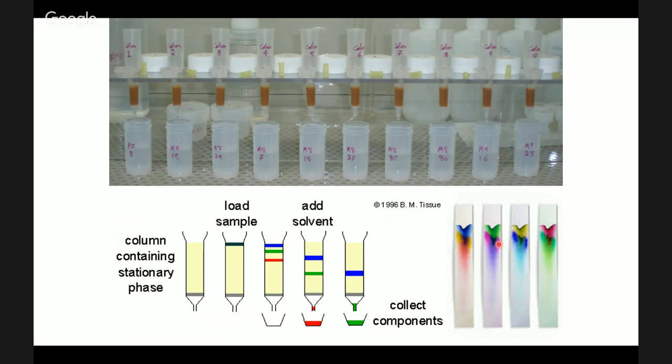Okay, and the way we do that is using this chromatography method, where we dissolve our sample and put it on the top of a column like this. In this column, we have some sand with some special organic geochemistry coating, which is essentially magic. That preferentially grabs on to different elements depending on which acid you're dripping through, and then over time, different elements, represented by different colors here, can drop out of the bottom of the column, so we can separate out the strontium from the things that we don't want in our sample.